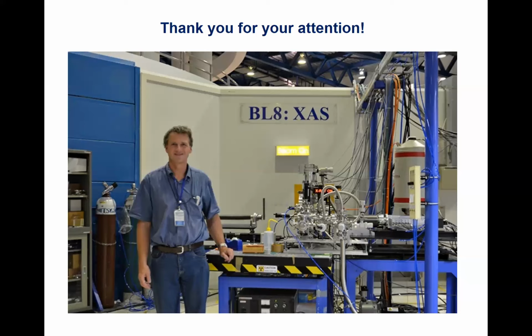And the next stage, which may be better conducted by people who are more trained in that, will be really explaining the underlying phenomena and physicochemical patterns which create the different pre-edge and also the post-edge features in the different calcium compounds.